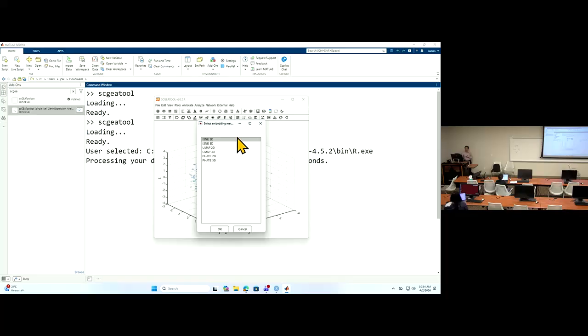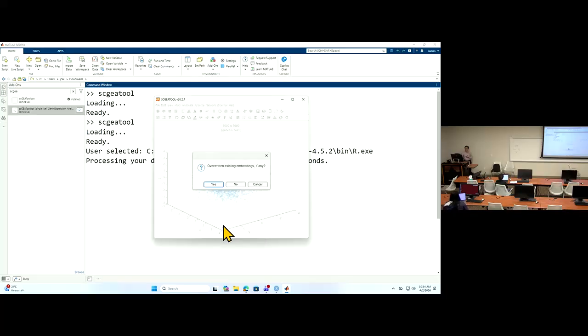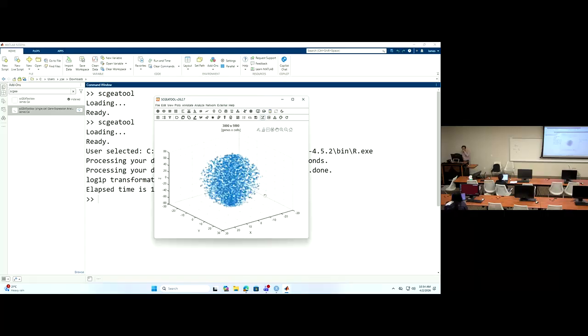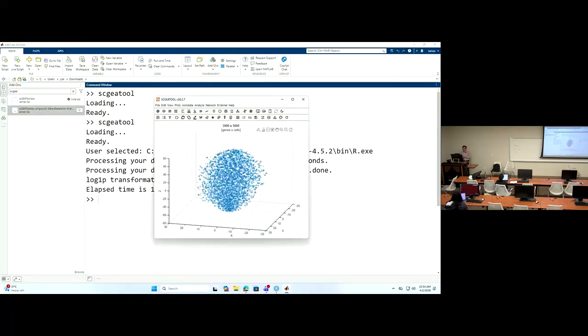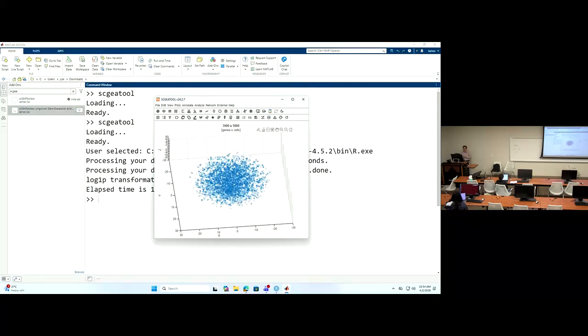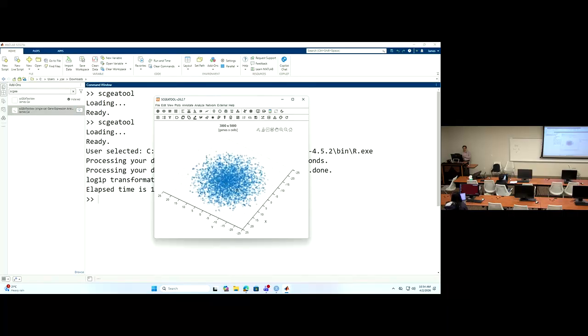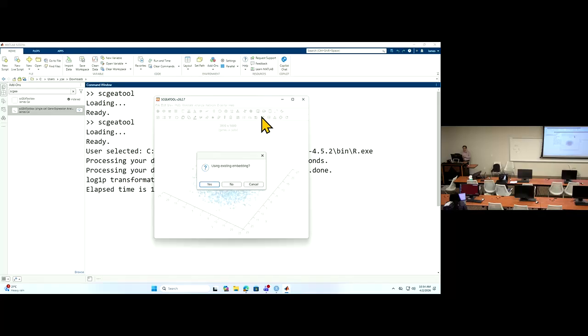If we do embedding using, for example, t-SNE 3D, it gives you one single cluster, as expected. It's round, in this sphere, this ball, and indicates no structure, a homogeneous population of purely random cells.